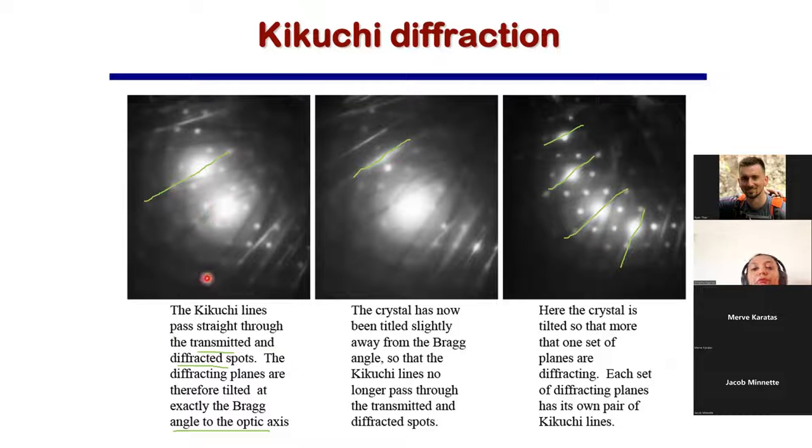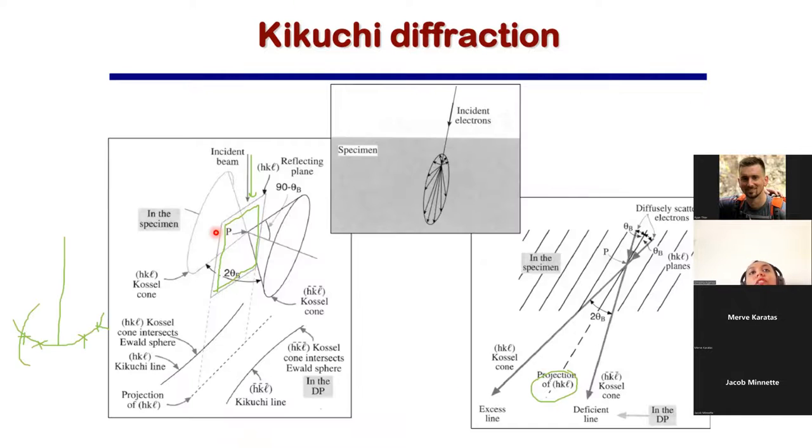So you know what? This is a very important question. You always do not see Kikuchi diffraction lines. Why don't you see that? Now, it all depends on your sample thickness. Your sample should be slightly thick to have multiple diffractions going on. And if multiple diffraction goes on, then only you see them. So for a sample which is really nicely made, you would not see them. For dislocation loop characterization, it's a very common saying, please keep your sample a little bit thick, because this is an additional diffraction going on, and you take an advantage of this diffraction, right?